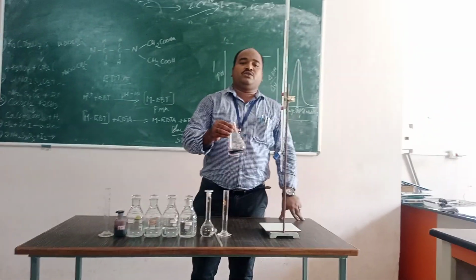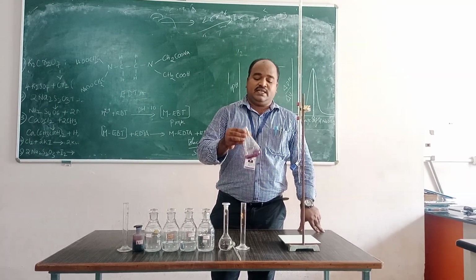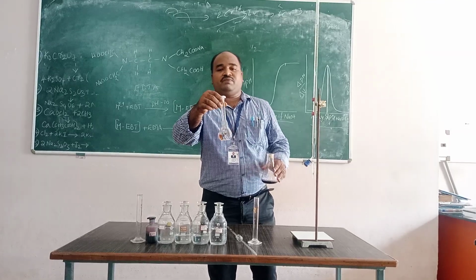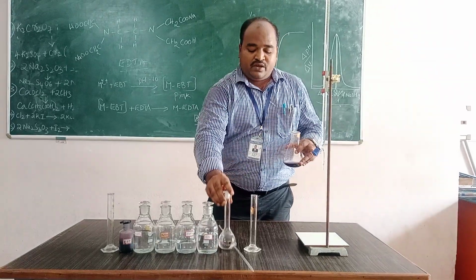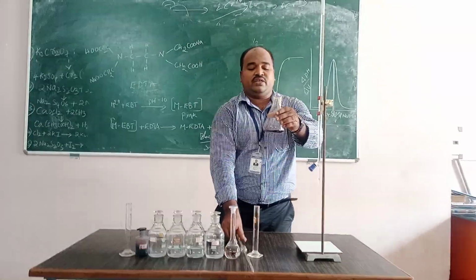Okay, students, this is the second step, estimation of zinc by EDTA. In this solution, I have already prepared an unknown volume of zinc solution in a standard flask. From this, I have taken 20 ml using a 20 ml pipette, then added it into the conical flask.